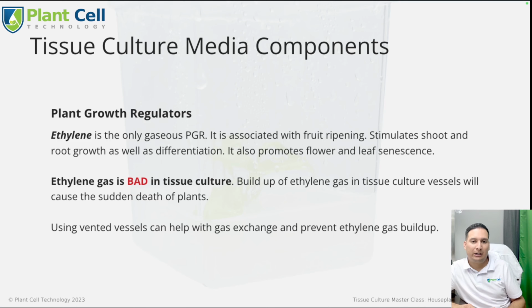However, you may ask, should I vent all my containers to prevent ethylene gas? I would not do it unless you're actually seeing the sudden death in your plants, and then you may have some ethylene gas buildup. But it's not going to be on every single plant, so you don't have to have vented containers for every single one of your tissue cultures.